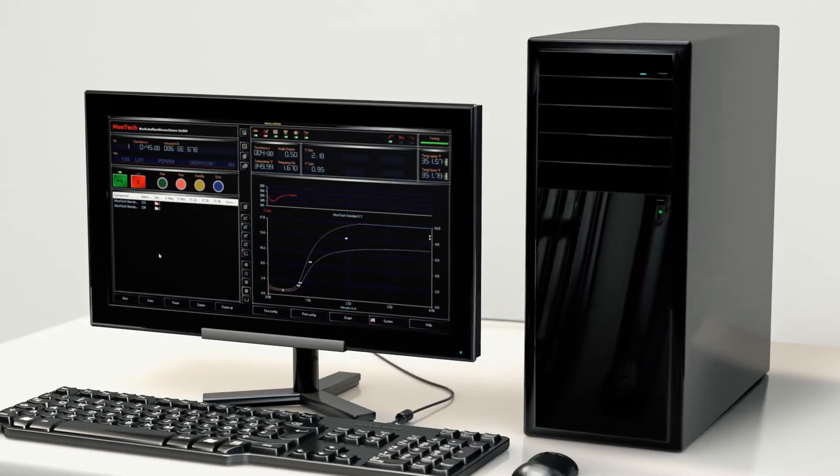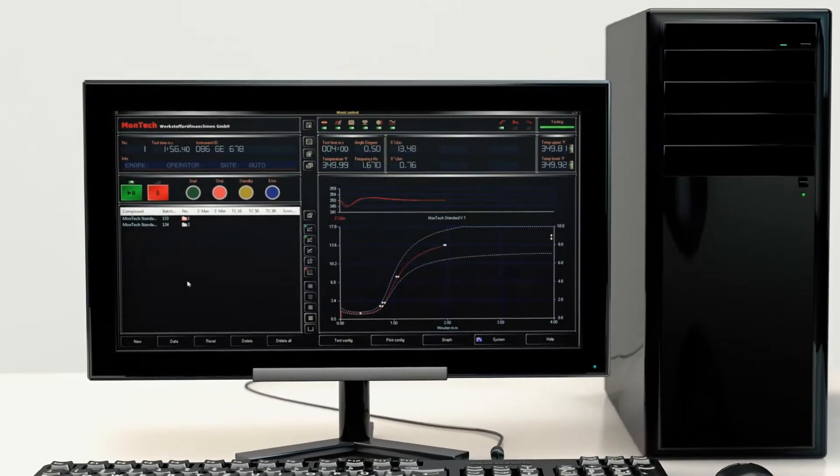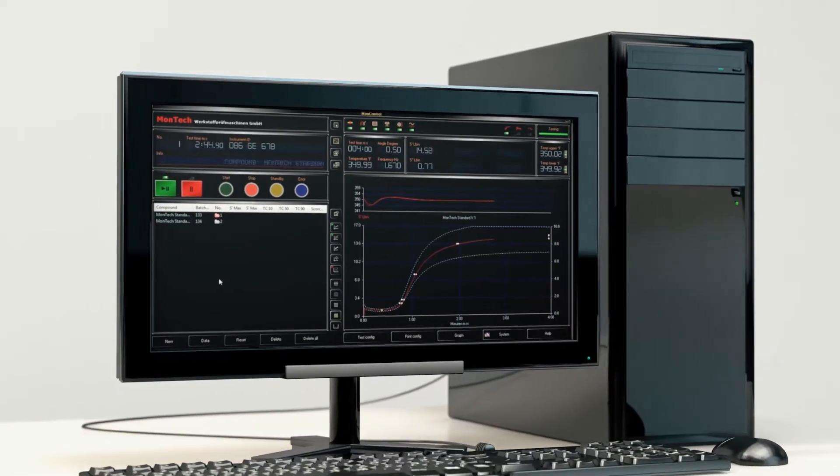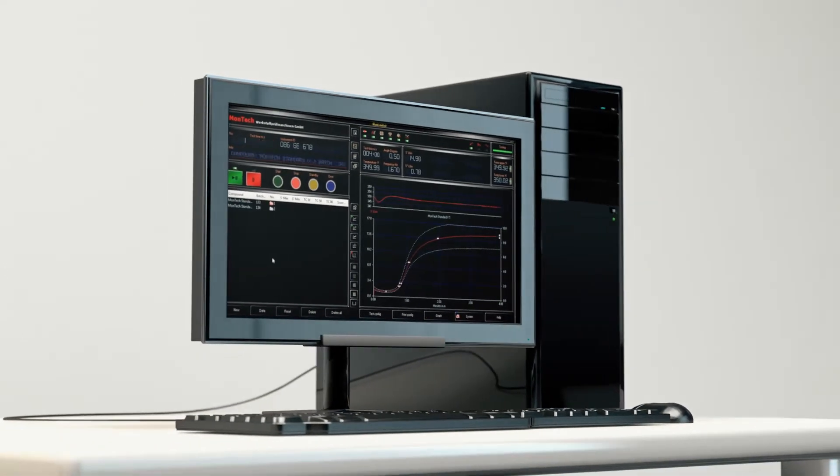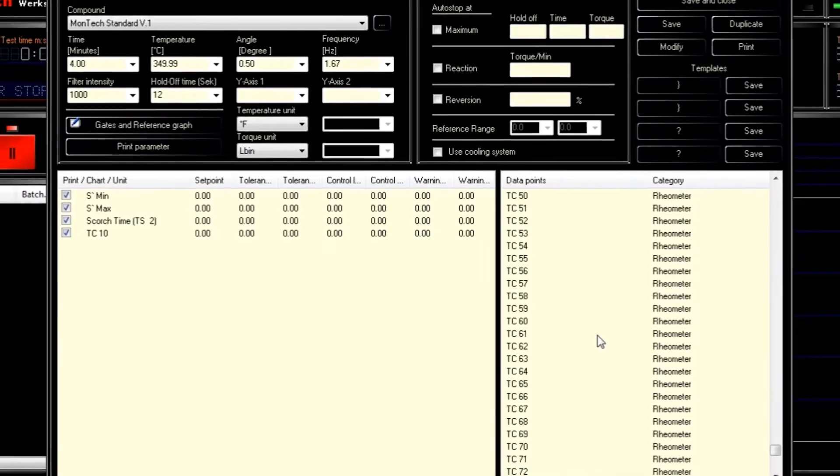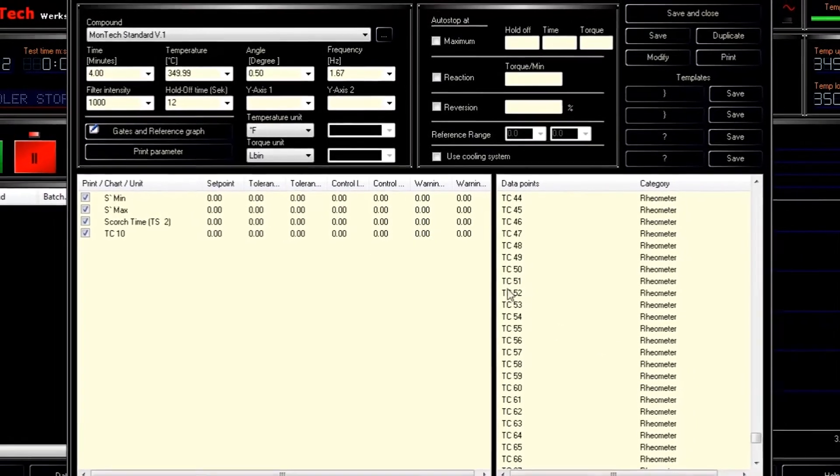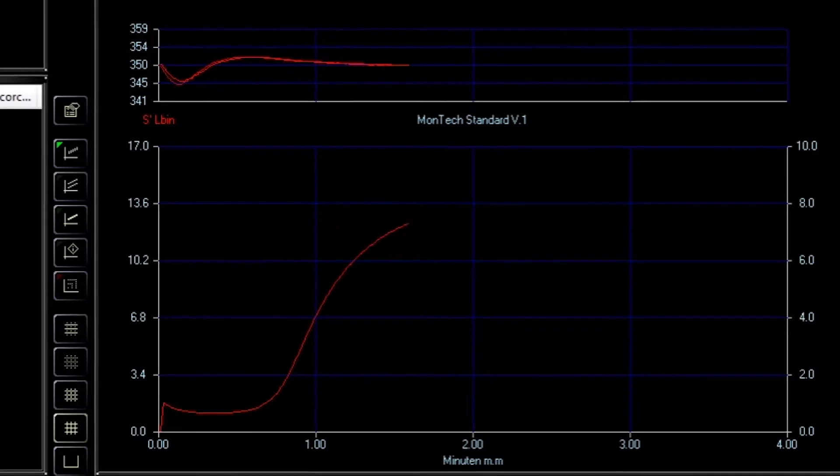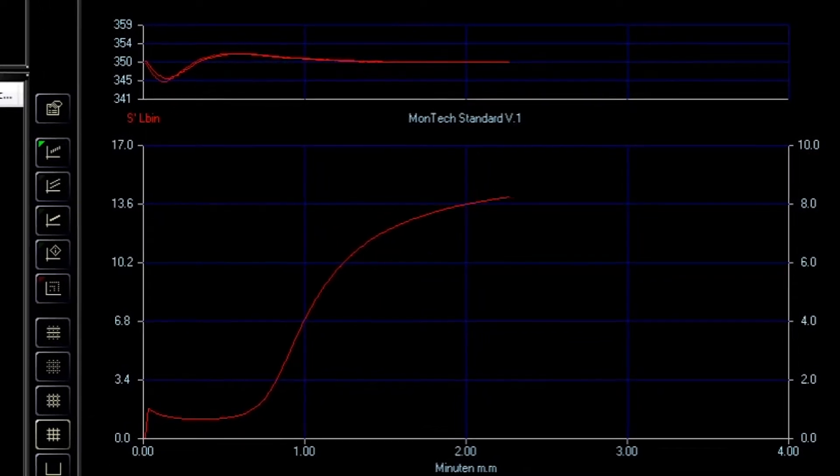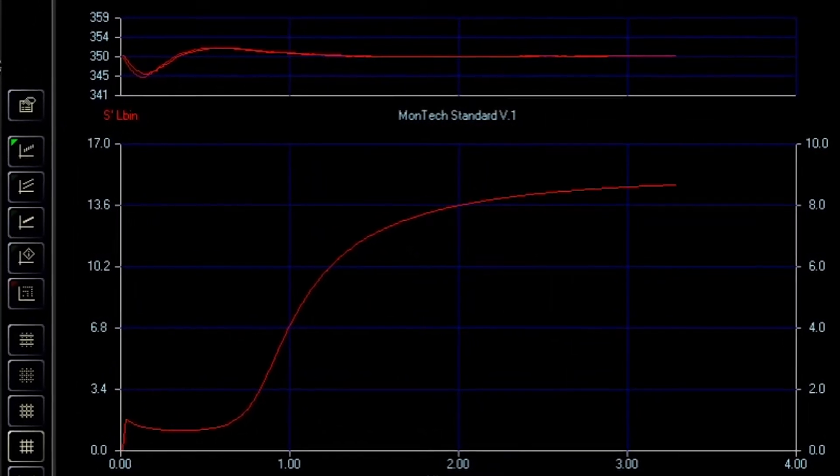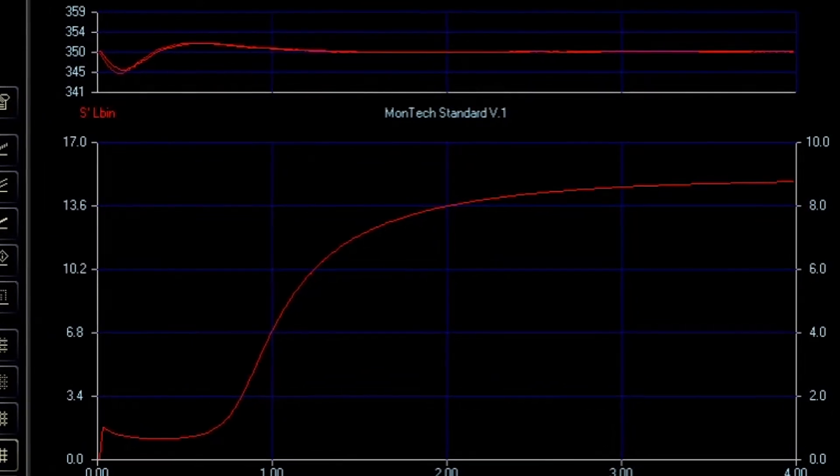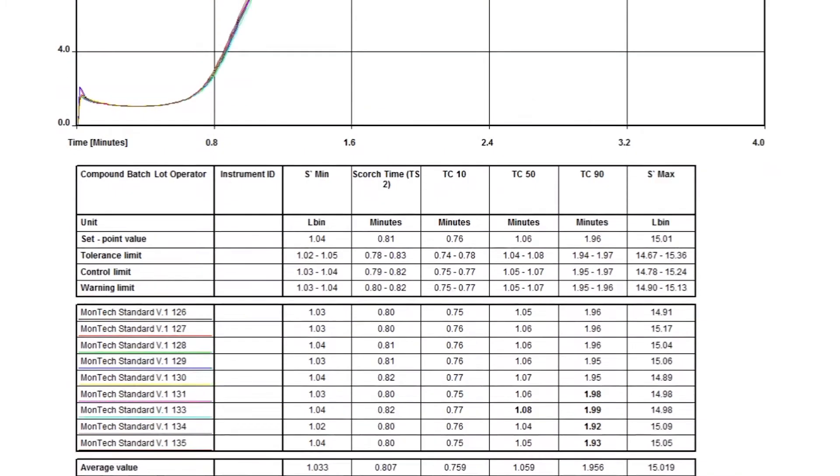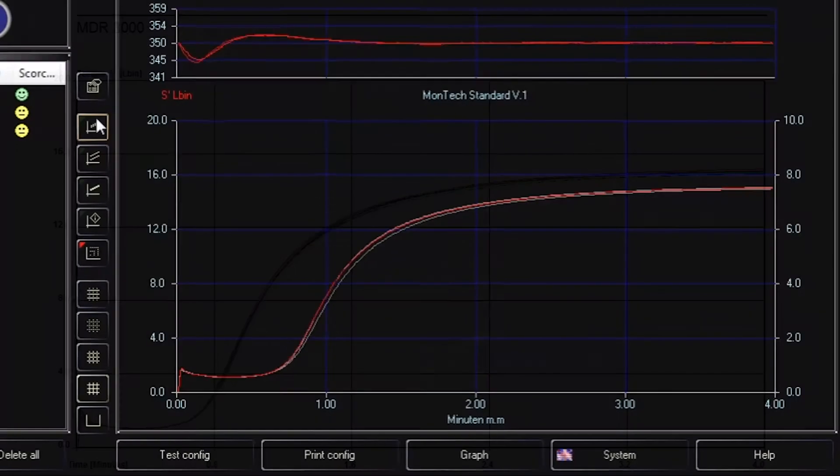The MDR3000 Basic comes with a new Windows 10 PC with MONControl software to create and execute test sequences, then record the results of the test performed. Thousands of test presets are available within MONControl, as well as the ability to customize these test parameters. Data from the test is displayed live in the software as the test is performed. The recorded data is used to assess compounds to ensure they meet quality control specifications. Test results can also be compared to previous test data to ensure uniformity between batches.